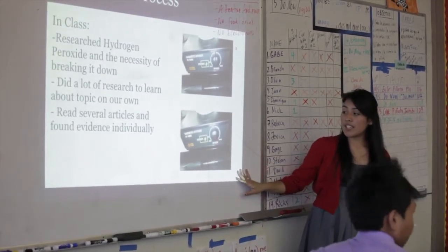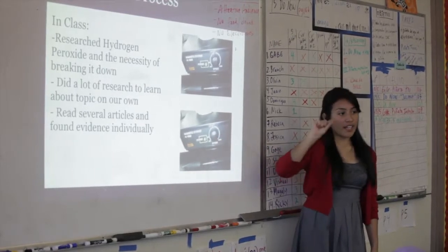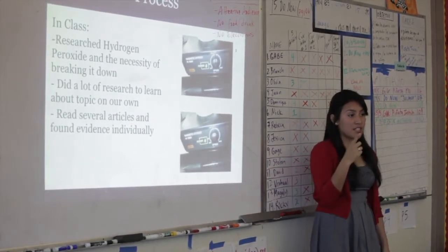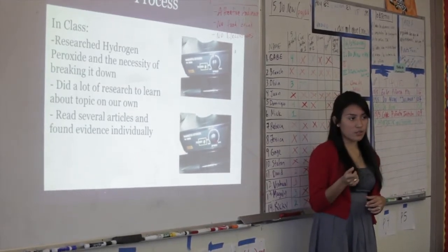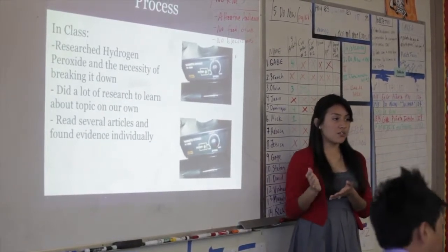And so the thing is that the little knob didn't have any indication of where it was pointing. So it was kind of through estimation that, oh yeah, this is medium, and trying to remember how fast the stir was going. So this was one of our errors, because I think one of the times it was a little bit faster than usual, and so our stirring speed wasn't exactly consistent each and every single time.